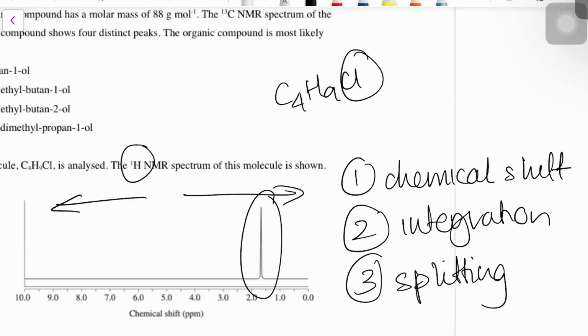And now you might be wondering, there's 9 hydrogens in there. How could there possibly not be one close to my chlorine? It could be that the chlorine is bonded to our carbon, and then the hydrogens are all bonded to the carbons that are bonded to that carbon. What that means is the carbon that's directly bonded to your chlorine might not have any hydrogens bonded to it. So the hydrogens bonded to a particular carbon might have another carbon separating it from the chlorine.